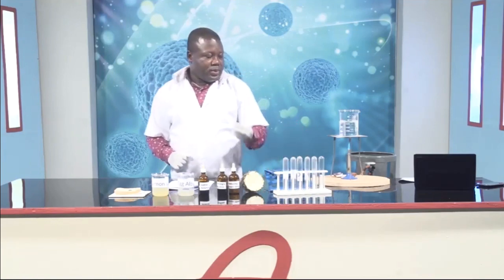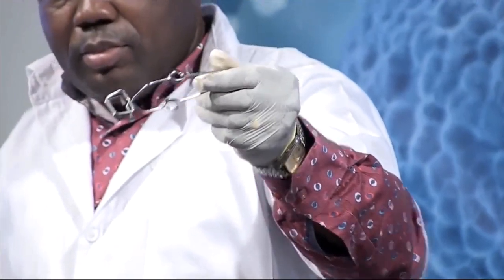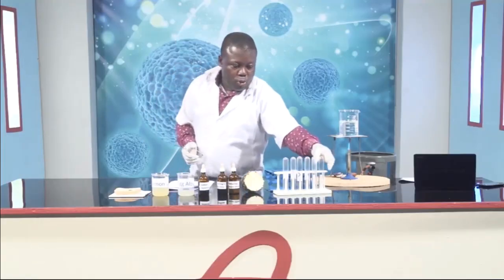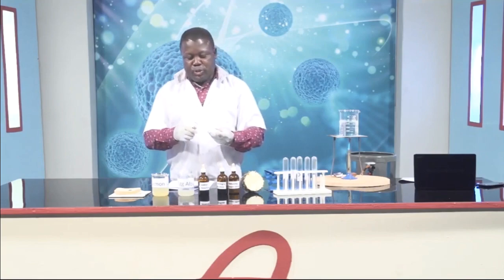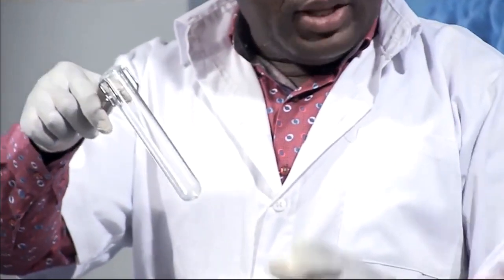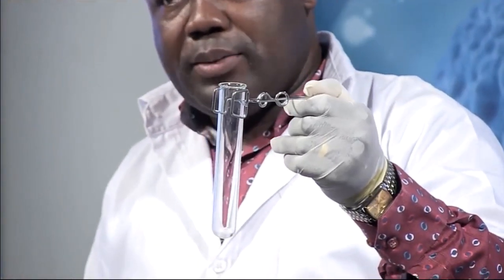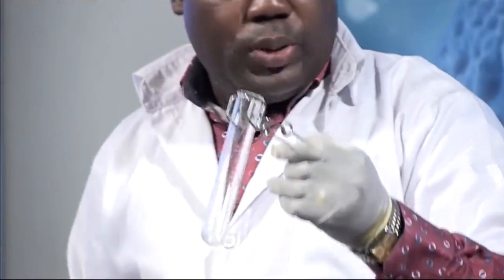We have our forceps also here. Since we'll be dealing with hot water, we need to hold the test tubes with forceps, or a test tube holder, to prevent burning of the fingers. Very important.